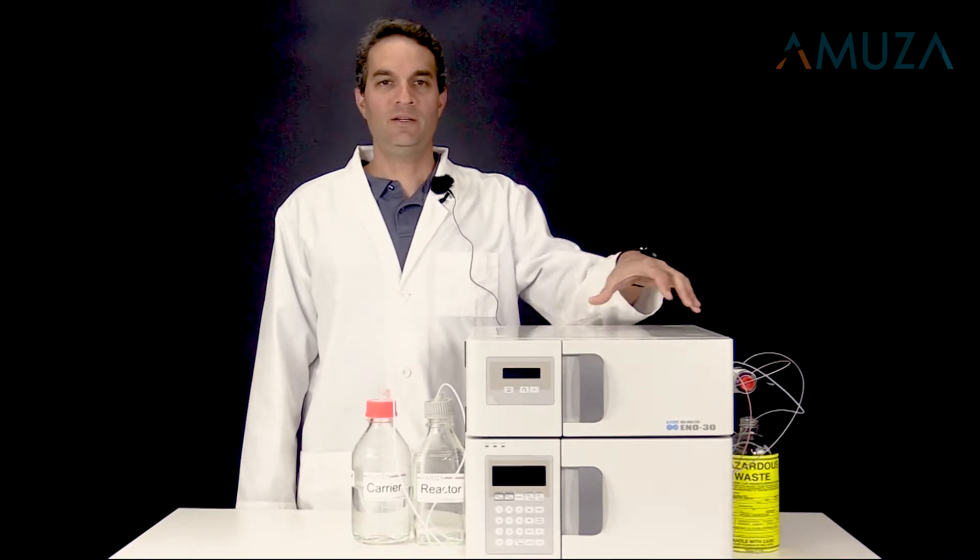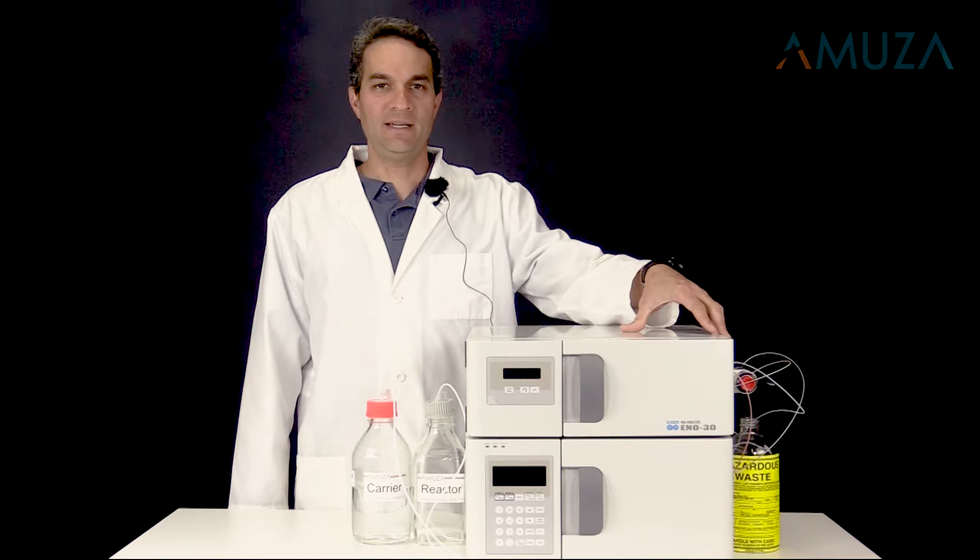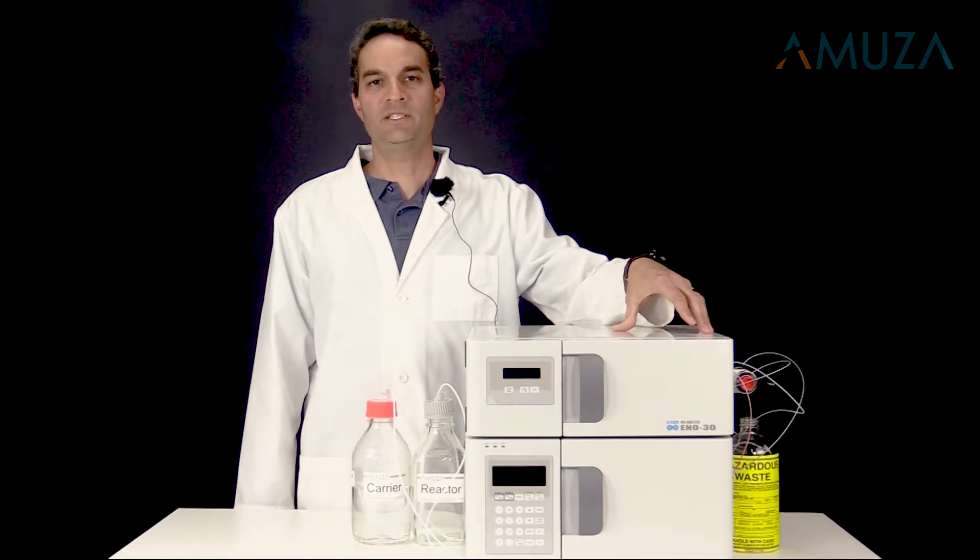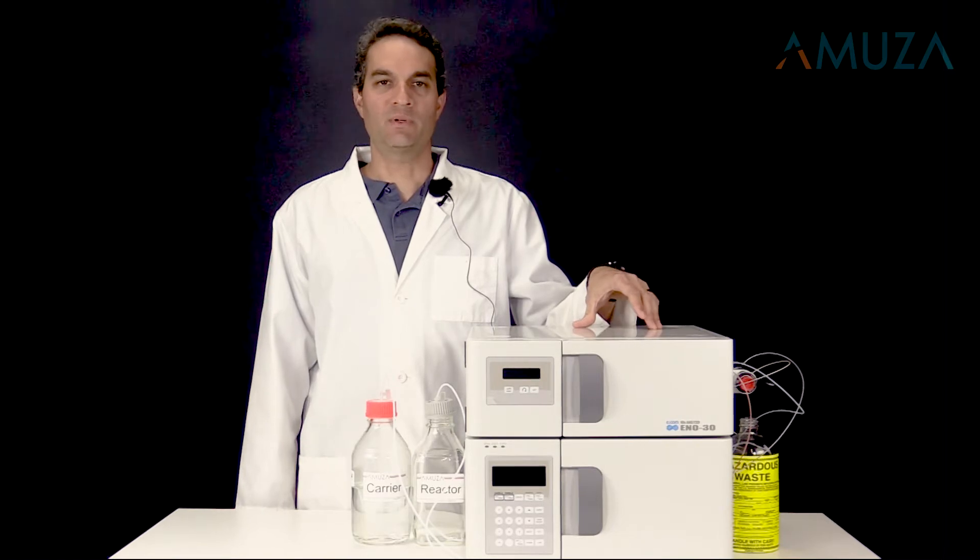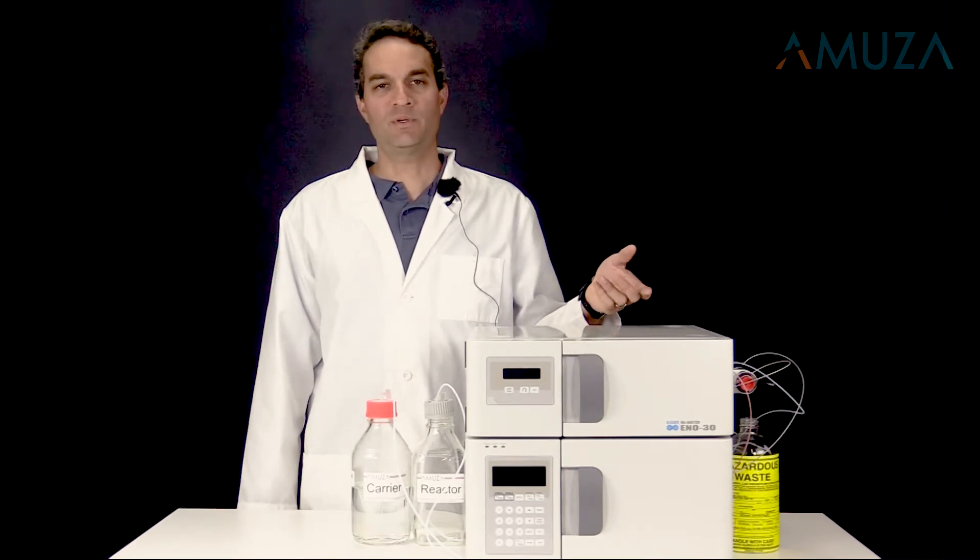By utilizing the ENO-30, you can get accurate data in 10 minutes from a single injection. Combined with laboratory automation using an auto sampler, you can run hundreds of samples overnight.